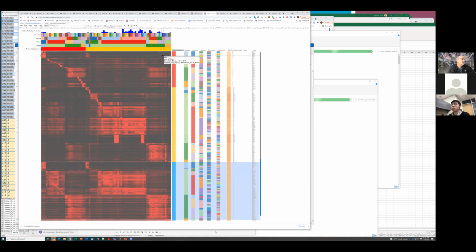Let's say there are at least two angles to consider. One is the number of cells present in each of those samples and sample groups. The other is what are those differentially expressed genes that are indicative of severe, non-severe, treated with steroids, not treated with steroids, early in the disease versus late in the disease. All of those are critical metadata parameters that are going to inform you about the biological processes that are leading to either a successful or an unsuccessful defense against the virus.